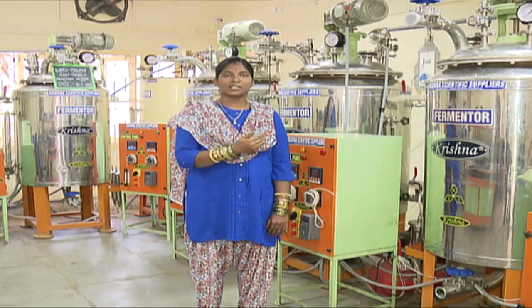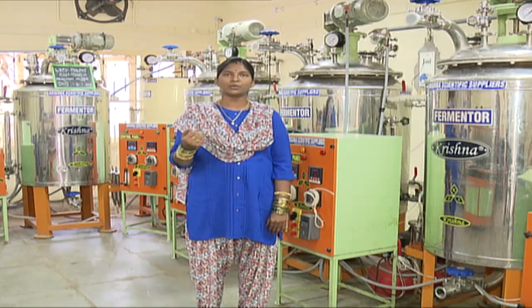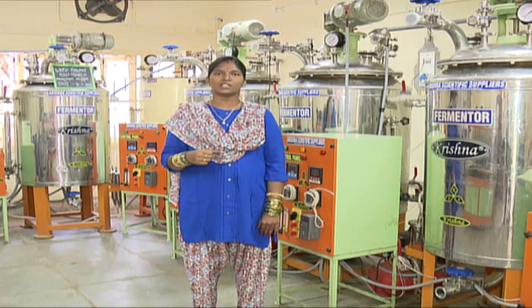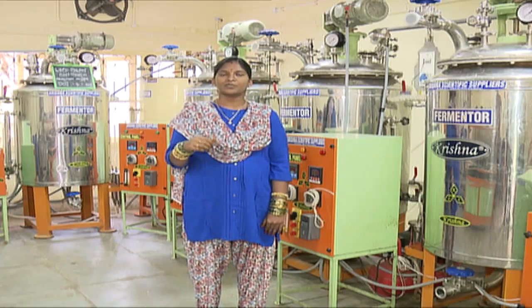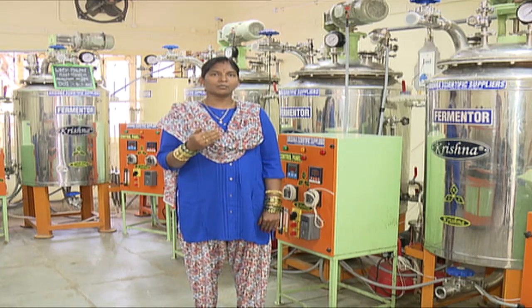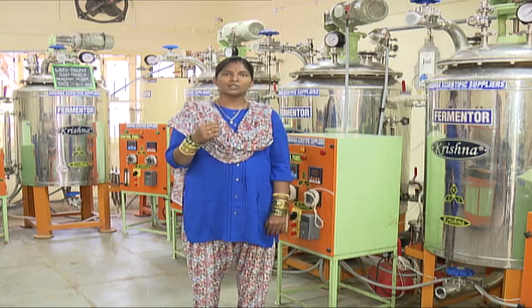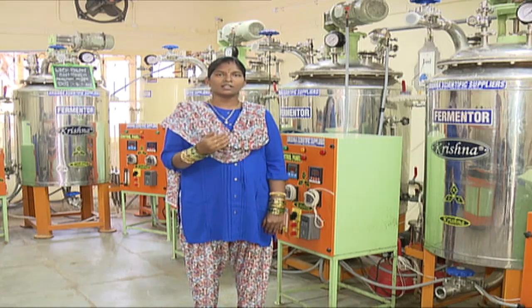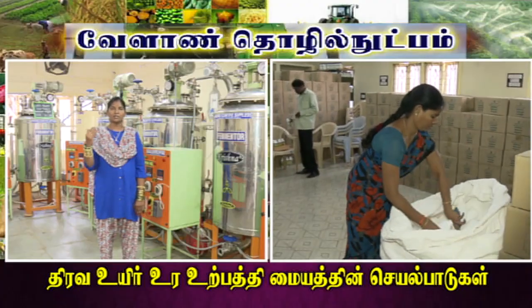We produce a cell concentrate using a tangential flow filtration unit. This is a recent advanced unit. In this unit, the bio-fertilizer cells are concentrated. When we produce the product, the cells are separated from the medium. The minimum medium is 200 liters, and when we add a 20-liter concentrate, we prepare it for the packaging unit.